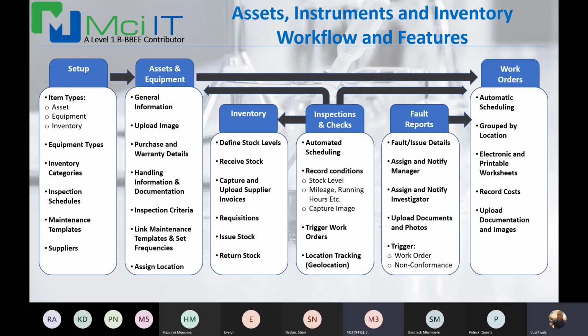Okay, so very briefly, in terms of the assets, instruments and inventory module, in terms of workflow and features, I think it's important to note, and I've mentioned this before, that in this one module we allowed the user the ability to not only set up an asset, deemed an asset by being above a certain financial currency value, but also equipment that isn't classified as assets, and inventory, all in one module. It's something that took a lot of design consideration because we realized that even enterprise ERP systems don't really allow for that at this stage.